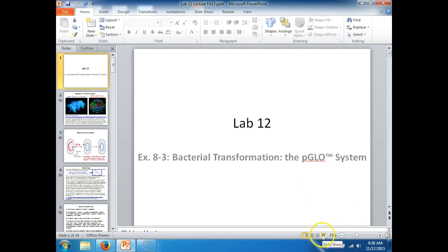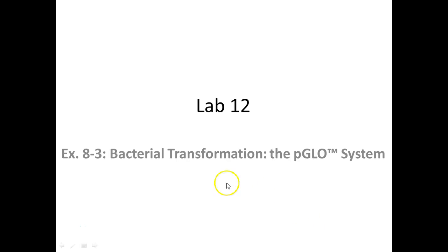Today is Lab 12, just one exercise. We're going to do bacterial transformation using the pGLO system. This is a kit that we purchased from Bio-Rad, one of the biotech firms.